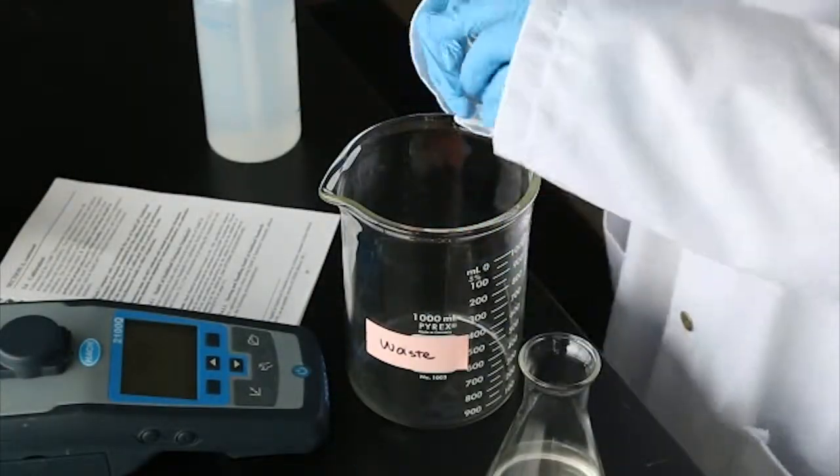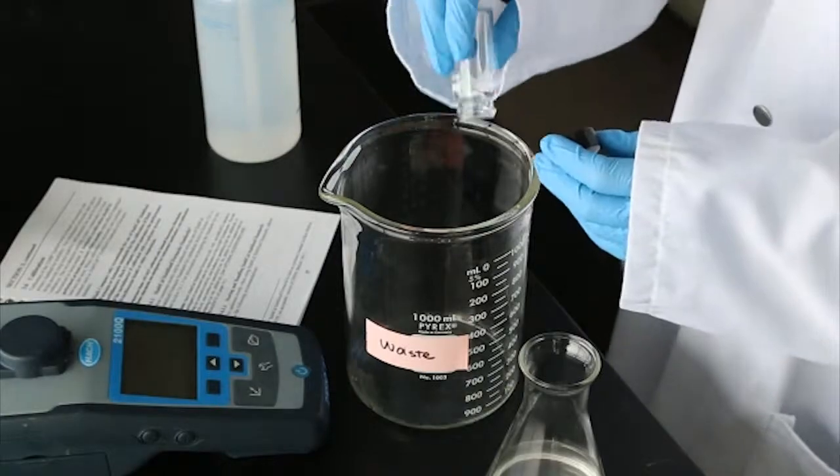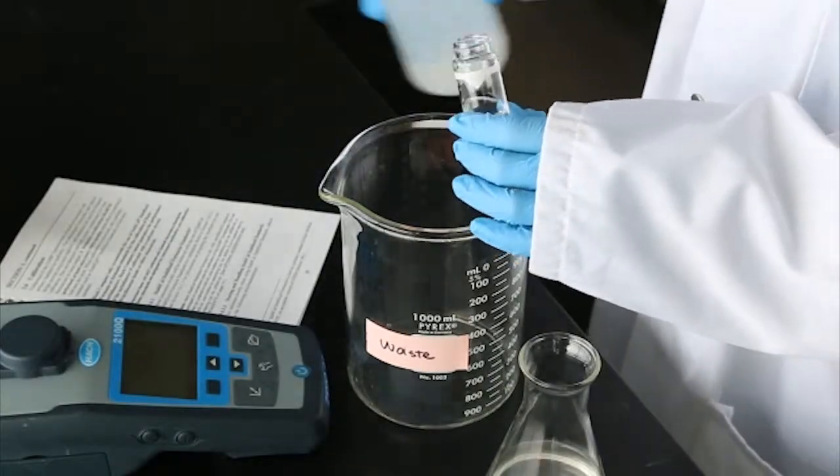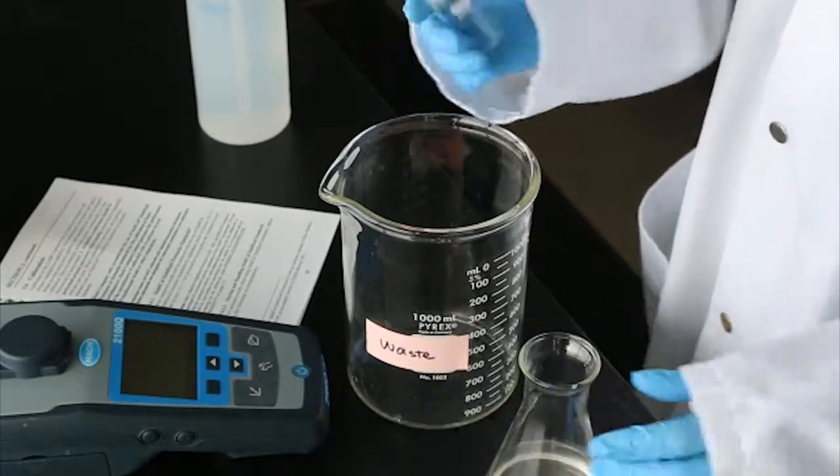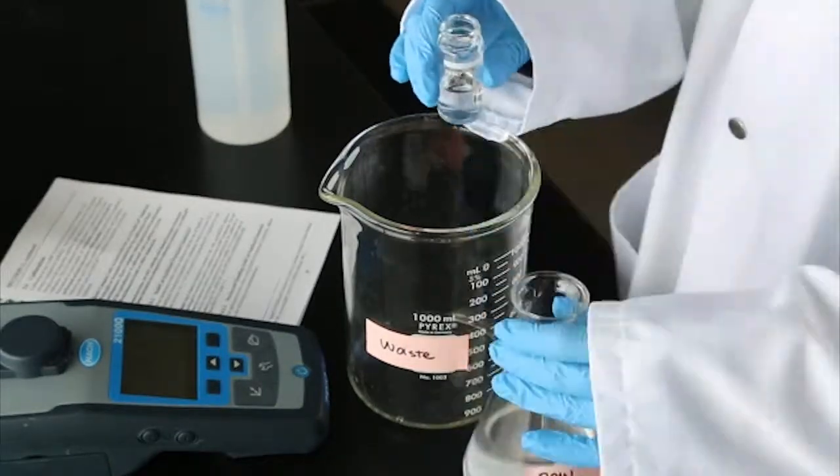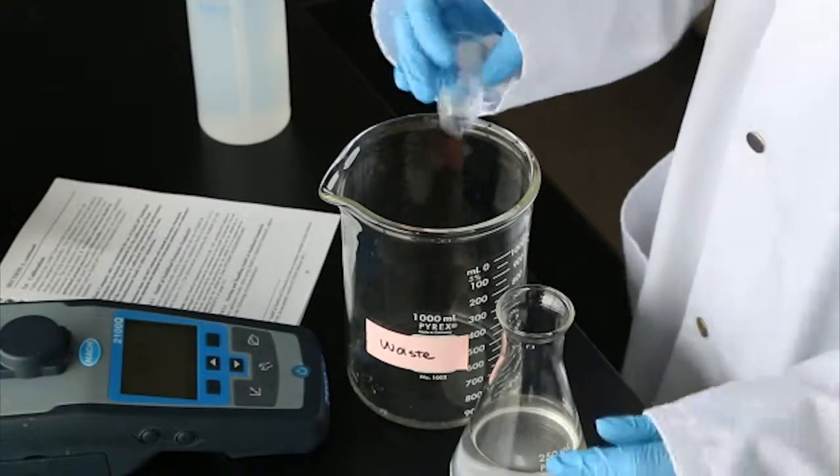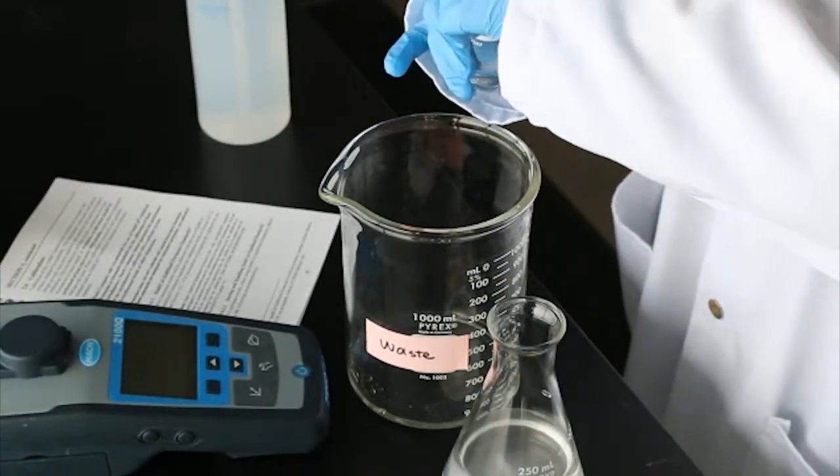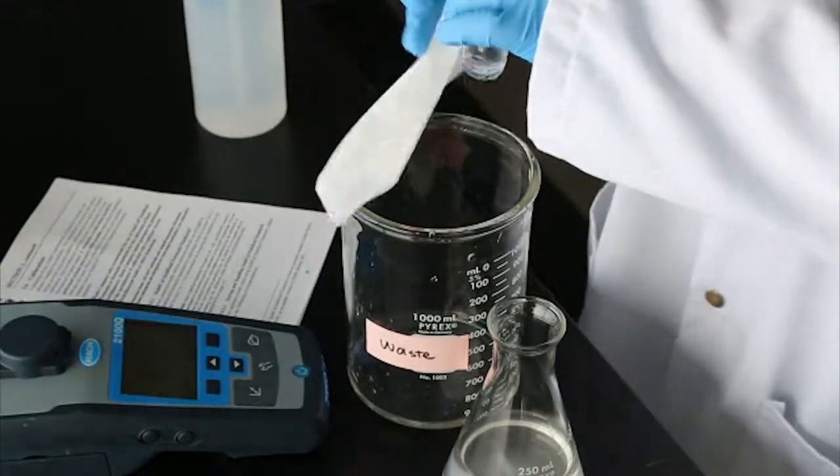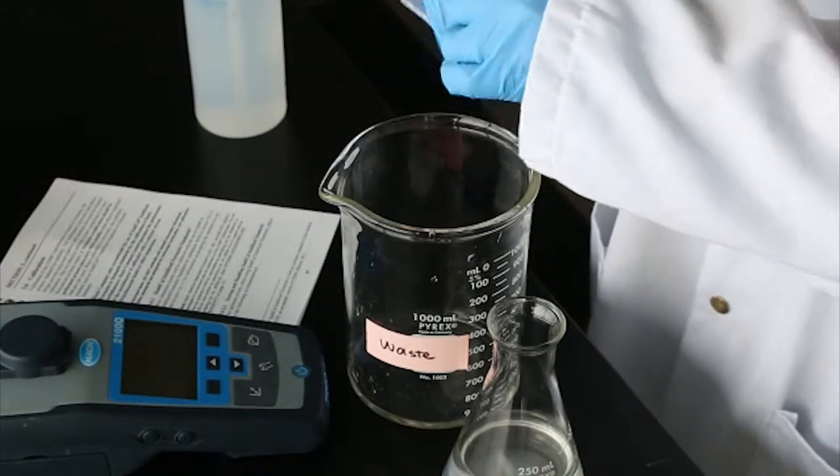Clean the inside and outside of the sample cells thoroughly with distilled or deionized water. Condition and fill the cell with the sample water. Make sure to handle cells only by the lid or wear gloves to avoid dirt and fingerprints on the glass.